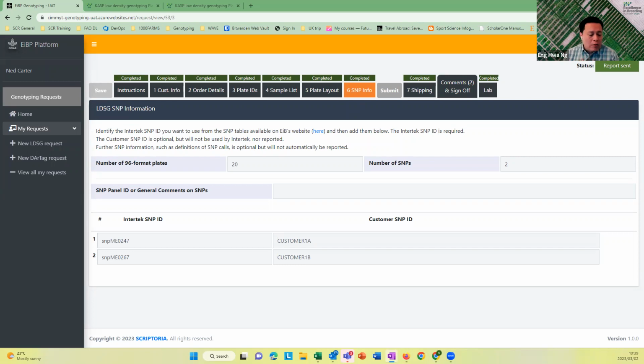And potentially also maybe a clone feature where, if you want to routinely submit jobs for like 20 SNPs and you want to do it every single season, we could also think about ways to just clone that job and change the samples, so that it saves you time. Right now, like I said, it's the minimum viable implementation. These are all part of the plan and should be available in the next iteration, one way or the other. Hope that answers your question.